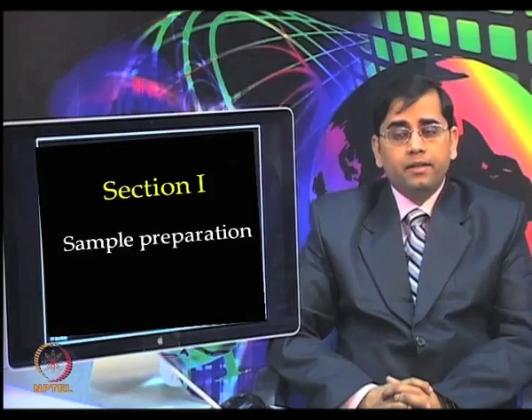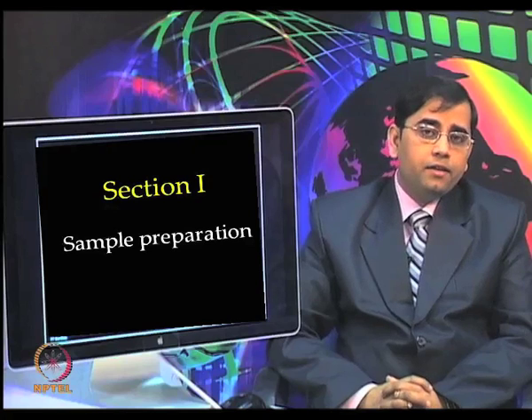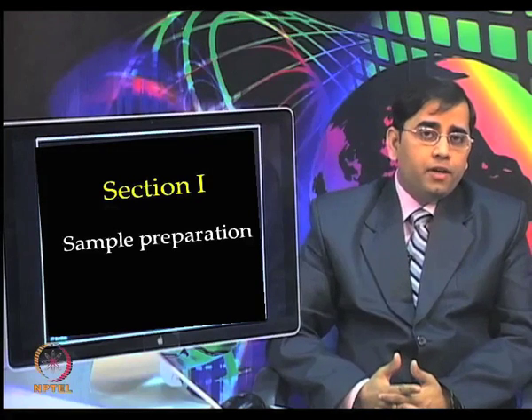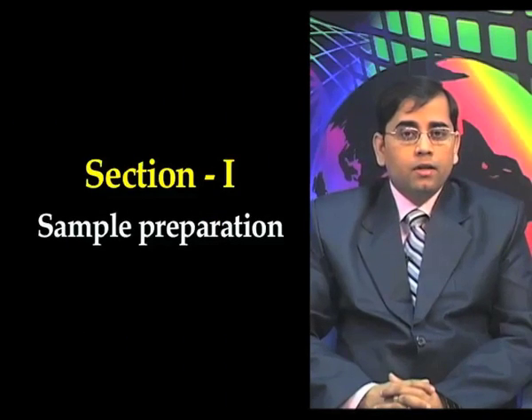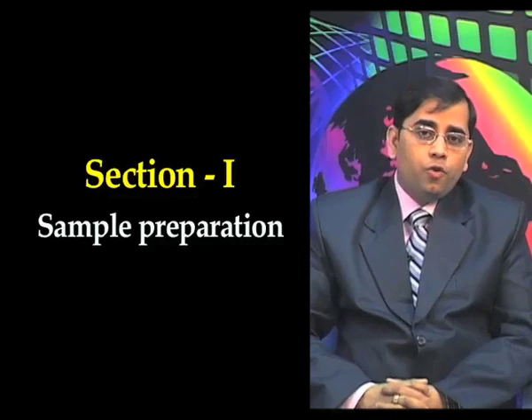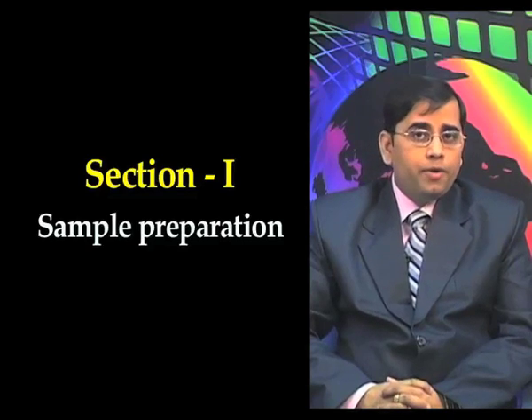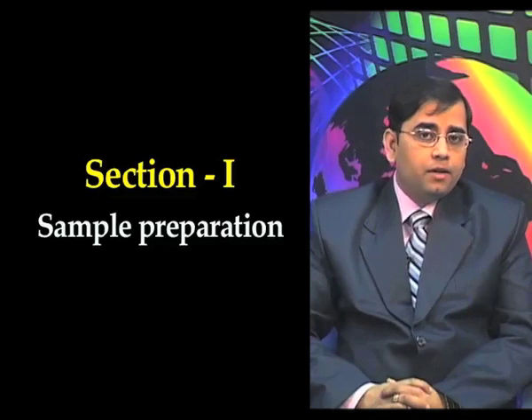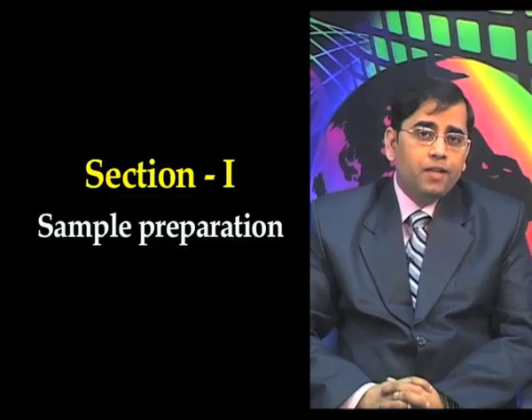So, the in-gel digestion of proteins isolated by gel electrophoresis remains the core area in mass spectrometry or in any of the proteomics applications. The following video we are going to watch provides a broad guideline for in-gel digestion. However, the recipe is very flexible and varies from lab to lab to meet the specific requirements of a particular proteomic experiment.